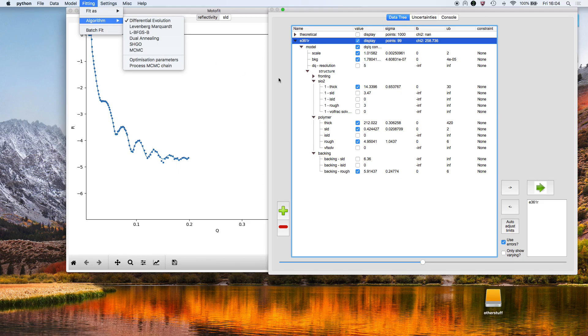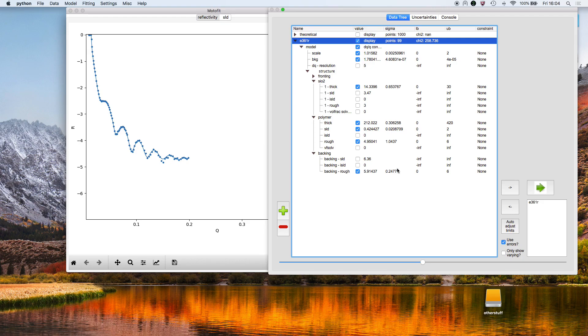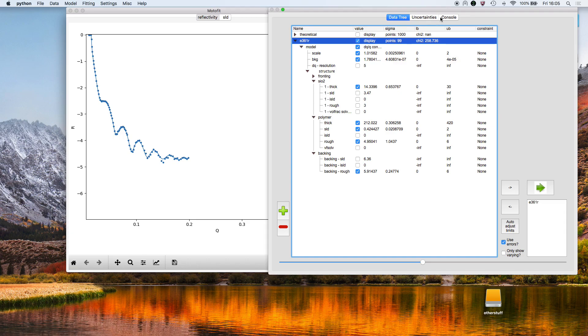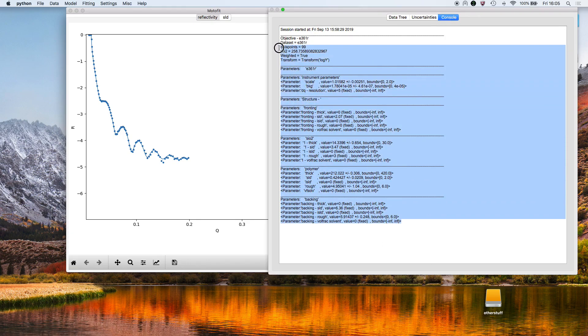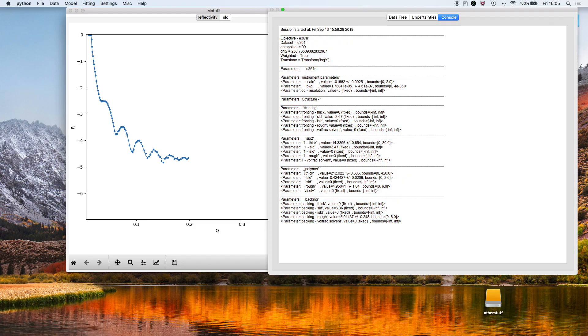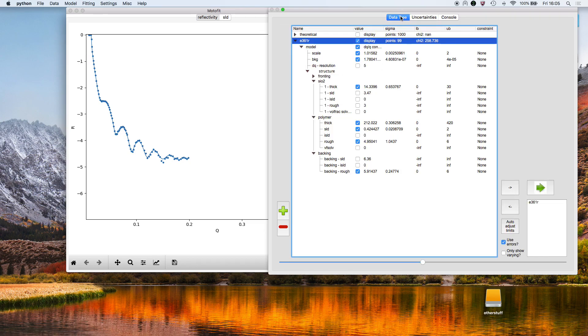Once the fit is finished, we see values in this column here which represent the parameter uncertainties. The thickness of the polymer layer is 212 plus or minus 0.3. If we go into the console, you'll see that reported as well. You get a printout of the structure, so here's the polymer layer—its thickness is 212 plus or minus 0.3.